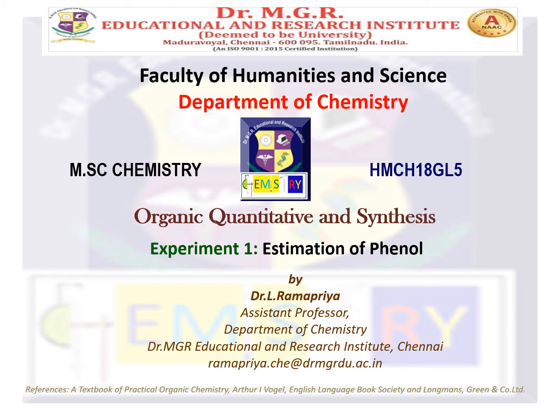Welcome to this video lecture on organic quantitative analysis and synthesis in the second year, third semester of the MSc Chemistry course. The first experiment we are going to see here is about estimation of phenol.